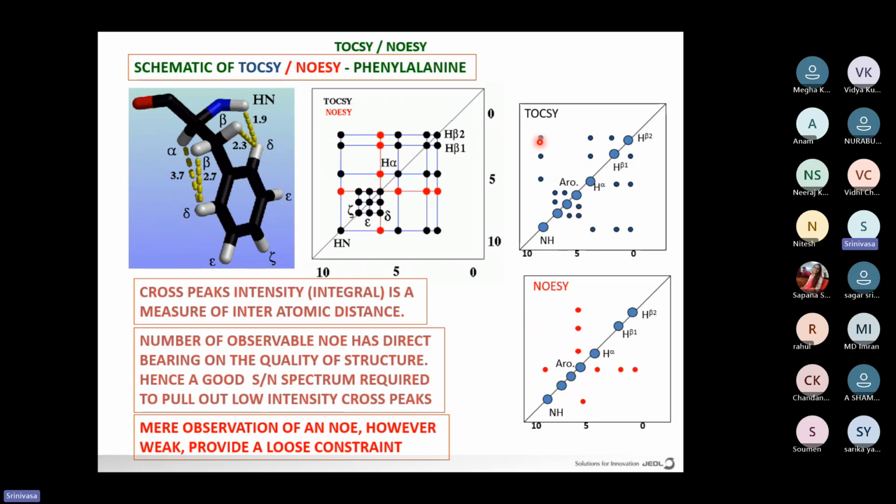And here, this black dot indicates a TOCSY experiment. TOCSY is basically through-bond couplings, as I mentioned, like 3 bond or 4 bond can go through like this. So this is the black dot. That's why you can see alpha protons. This proton is coupled to the next, and there is no coupling to the other protons, delta here, but you can see alpha is giving the red dot. You can see the NOESY peaks between the delta here. It indicates that these are spatially correlated, spatially nearby. So in NOESY, if your spin systems are closer than 5 angstrom, those peaks are picked up in the NOESY experiment.